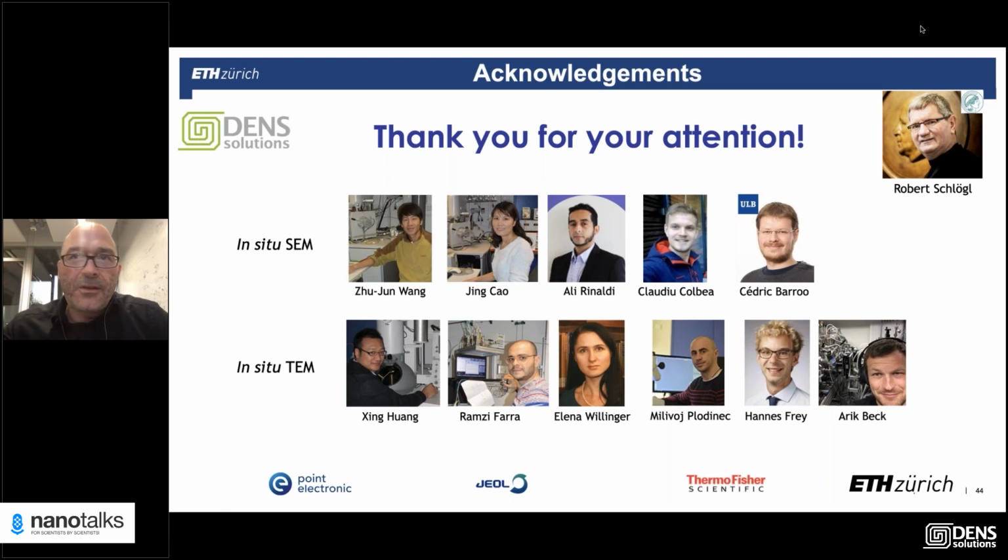Then there are some security regulations normally. Just wondering if H2S is too extreme. I don't really know, it depends on the concentration and on the security measures, and then maybe for the materials you need to ask the manufacturer. You don't want the window to break, for example, in your experiment when you work with such gases. But I don't want to give advice and then something bad happens with such specific gas types.